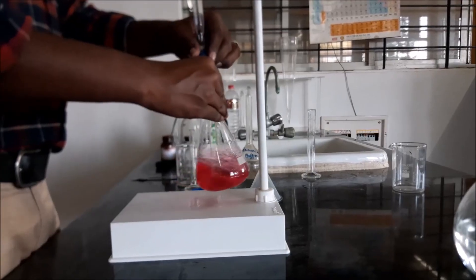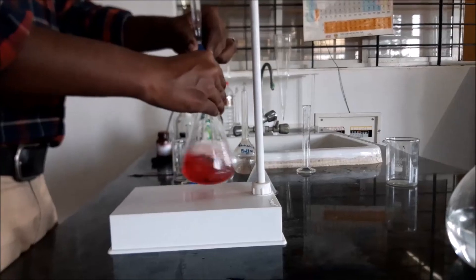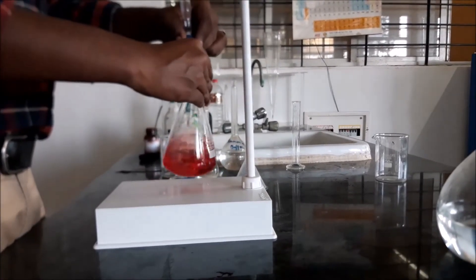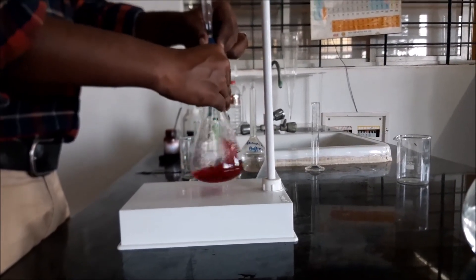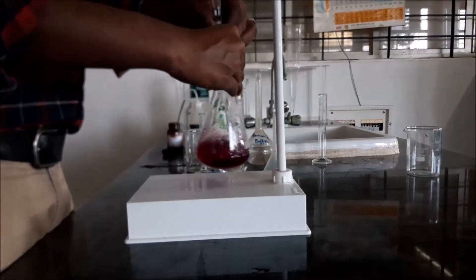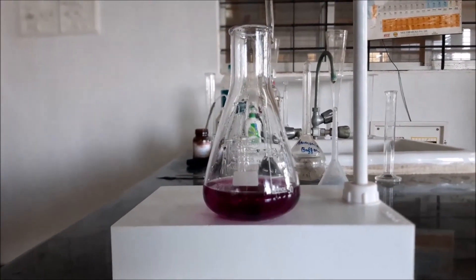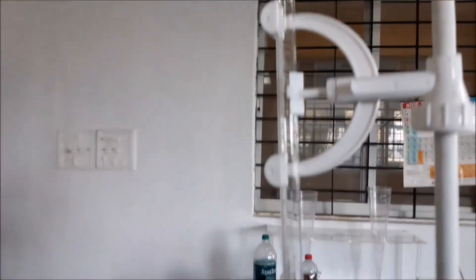After titration, the colour change indicates the presence of calcium hardness. The initial burette reading was 0; note down the final burette reading for the calculation of calcium hardness.